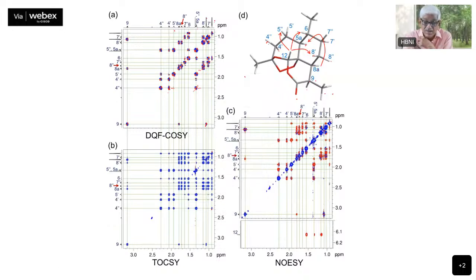This first one there. Is it at 0 ppm? No, it's not at 0 ppm. It is a singlet. That is not assigned there. And it is showing to that also, which could be that. All others are assigned. Is anything missing here? See, that peak is connected to almost all peaks. That was connected to almost all of them. Which one is that?